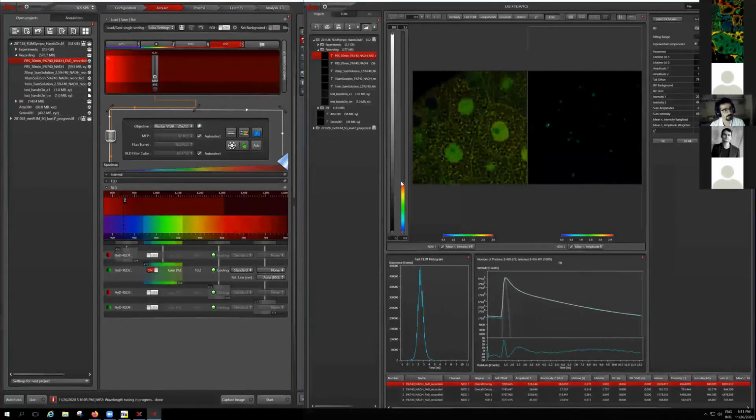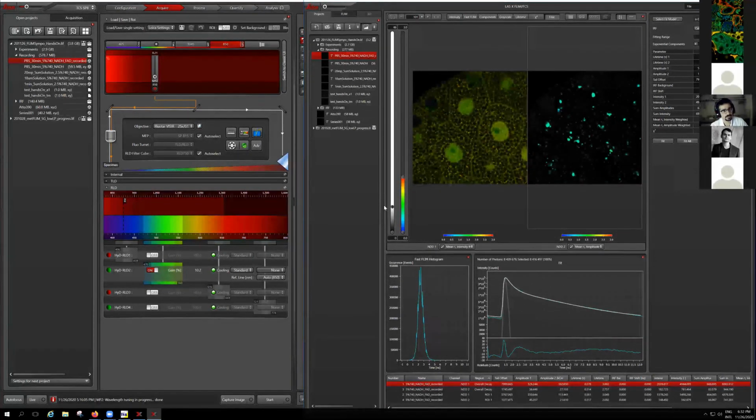It's comparing one to one with each other, so I can put from 0 to 3 for both of them, and then compare that one of them is more reddish yellowish and the other has only a few. So I can make it a little bit brighter to see the other ones also.